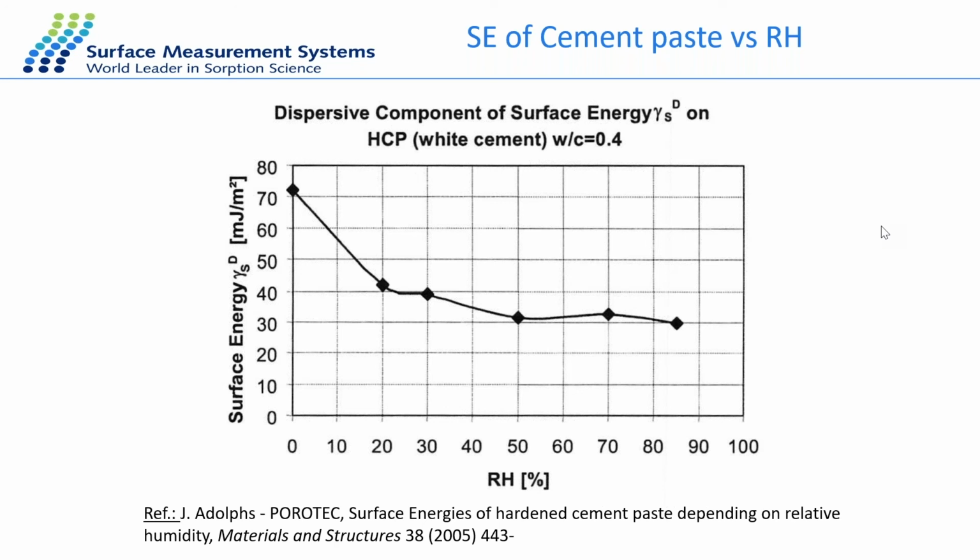I always just start with the highest achievable coverage. I usually use the coverage injection. In that case, of course, the achievable coverage range depends on the BET surface area that you entered into the sample ID.